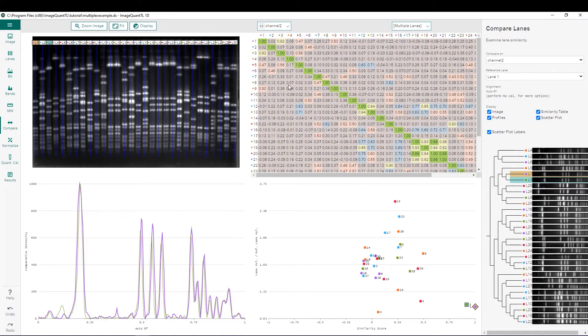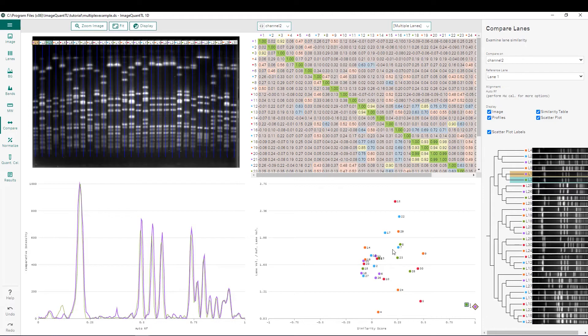Next to that we have a color-coded table that shows relative similarity scores between different lanes within the gel, and below that we have a scatter plot that shows different lanes and how they compare to the reference lane, in this case which is lane 1.